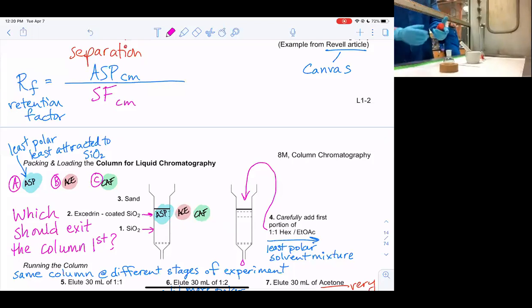Yeah, so the first part of the experiment, we have Excedrin, which is a pretty common medicine, and it is composed of three components: aspirin, acetaminophen, and caffeine. These three are all put together in a pill alongside some insoluble things that we don't really care about. So the first thing we're going to do is take our three components out from the pill, discard the insoluble components, and then put them into a state which Avery can actually use to separate them out.